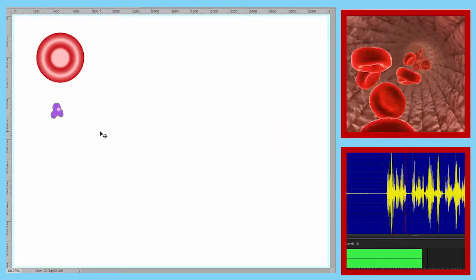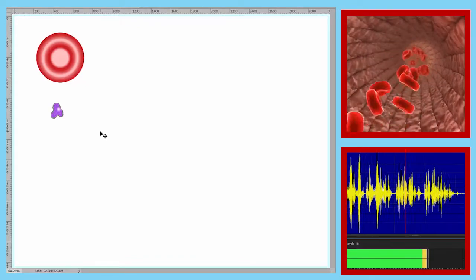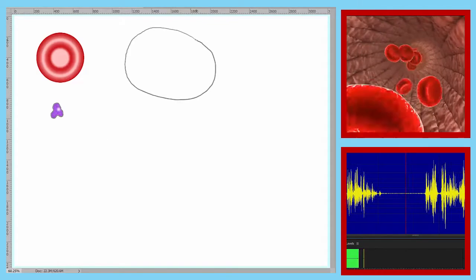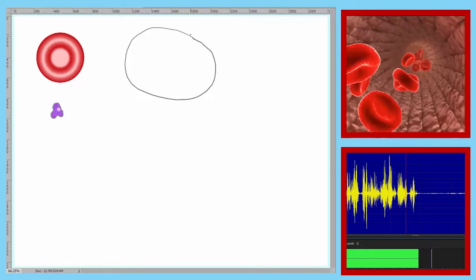This next formed element that I've shown here is a cell fragment. And again, we've named this one before, but we aren't going to name any of them here. Let's move to our next formed element. As you can see, this next formed element is much larger than our red disc.